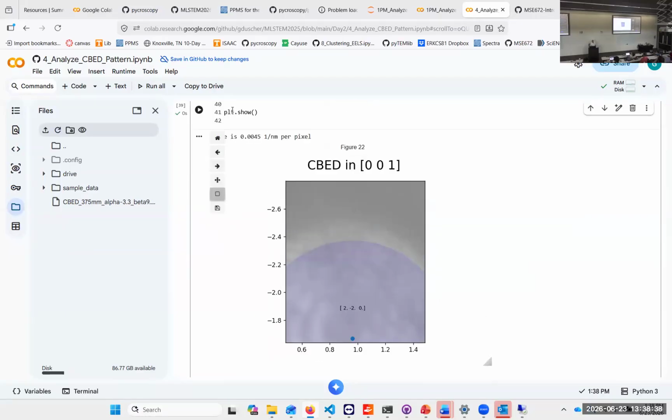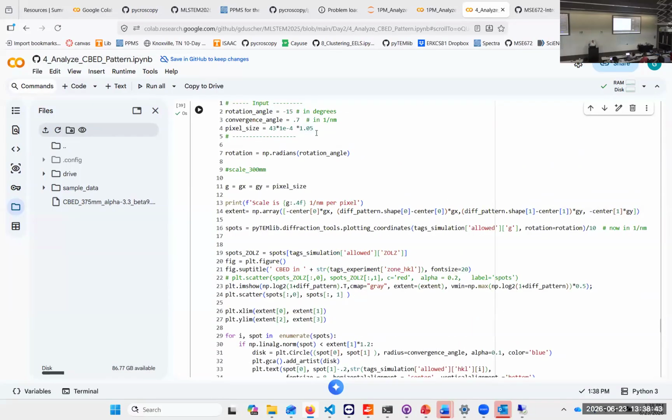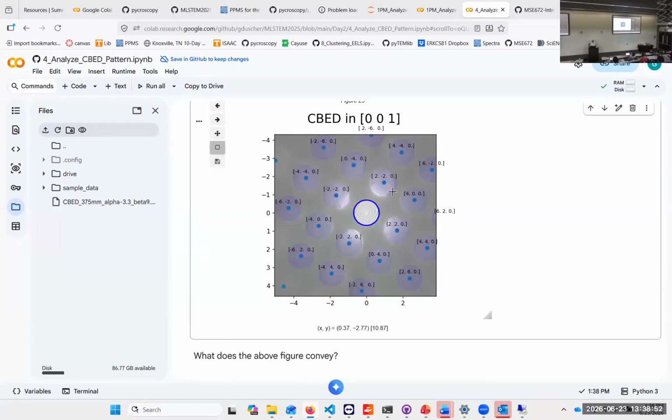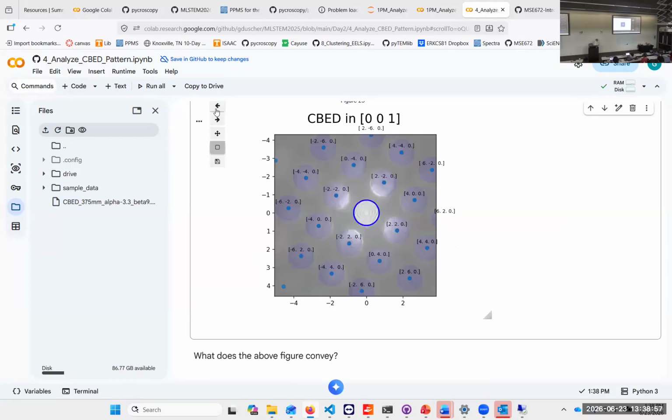Is also very clear. So certainly within 1% easily. That's even too much, right? So you can do that actually with sub-percent precision. So that's a very precise way of doing that. So it's much easier if you have real blobs in there. So if you have parallel illumination, we have just spots. These spots can be found with a blob finder. Here we can't.